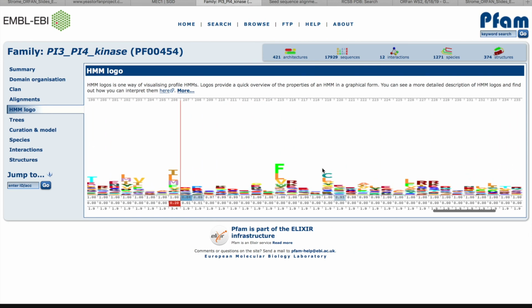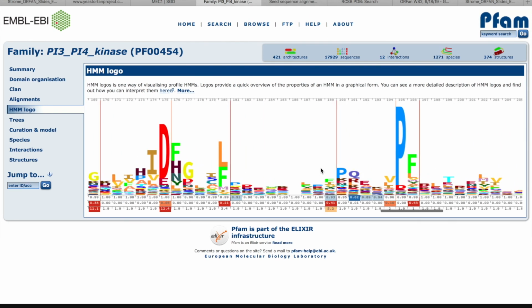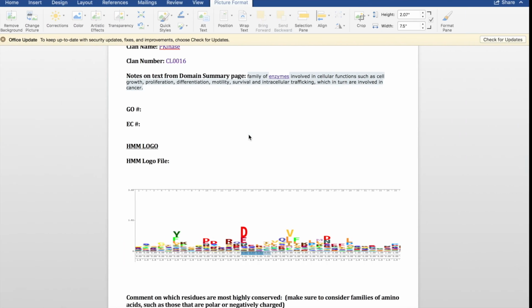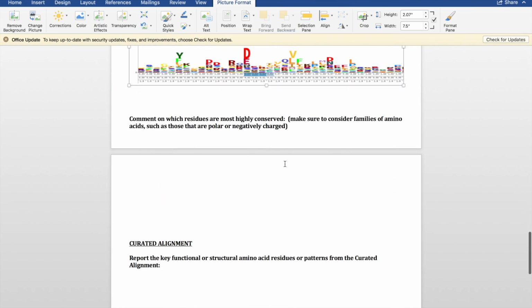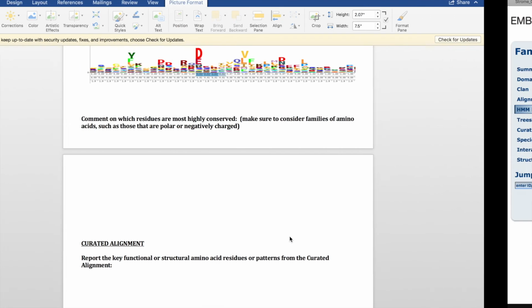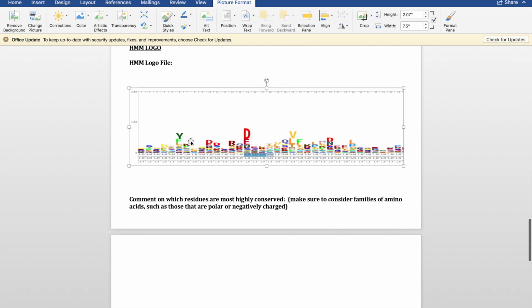And then another one like that, and for example, you have this one with the F and the H, and that one's fairly tall, but it doesn't have one large outstanding amino acid, so that would just mean that the majority of those amino acids are highly conserved and have similar properties. And then in terms of that, you can make notes of really significant ones, like that really large phenylalanine group.